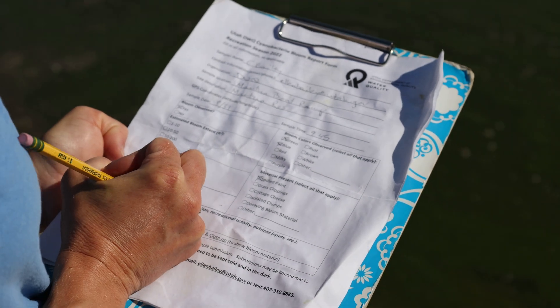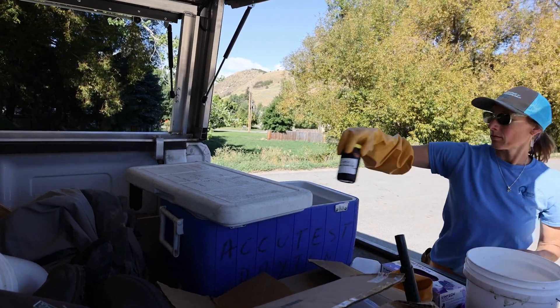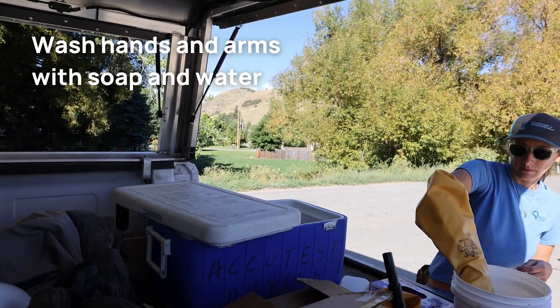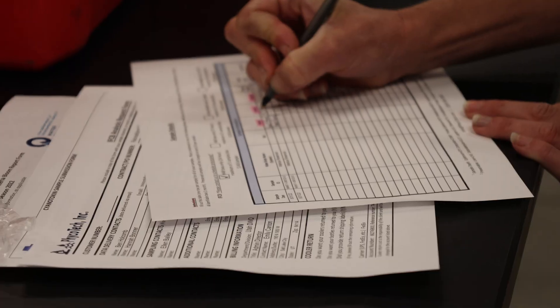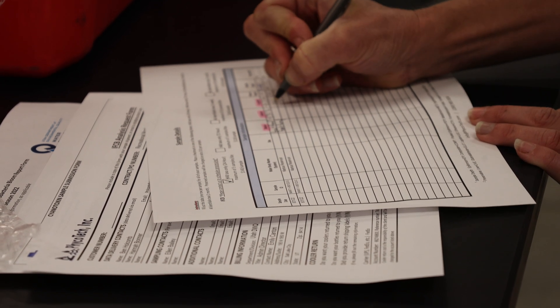Fill out the data sheet. Store the sample bottles in a cooler on ice. Follow that up by washing your hands and arms with soap and water. Back at your office or lab, fill out the chain of custody sheet.